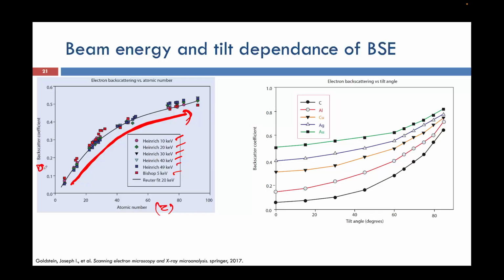Even if we increase or decrease the beam energy, my backscattering coefficient is not varying.